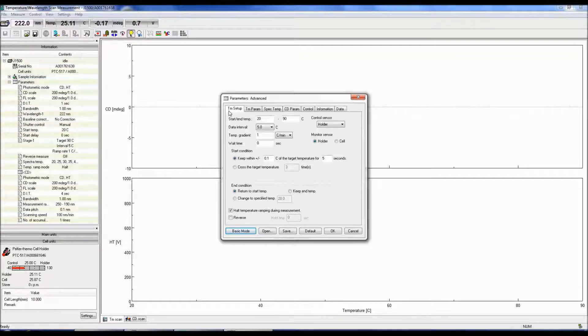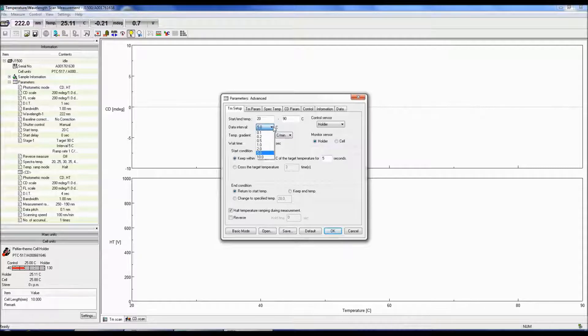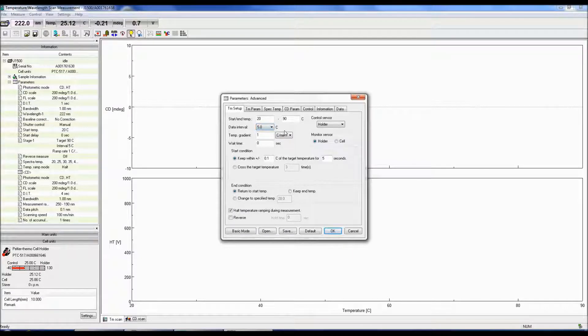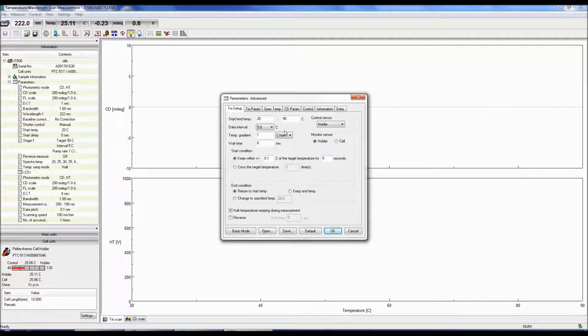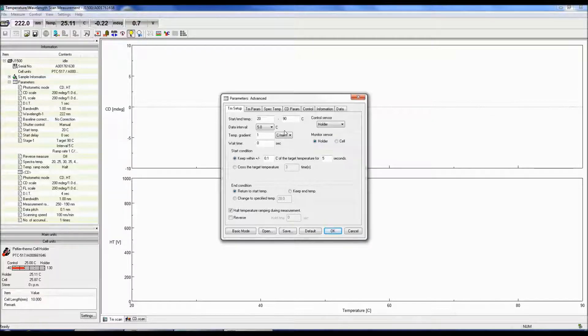Data Interval determines the temperature intervals that the CD signal will be acquired at. The temperature gradient defines how quickly the temperature will increase every minute. If this is your first temperature scan measurement, one degree per minute is a good starting point.